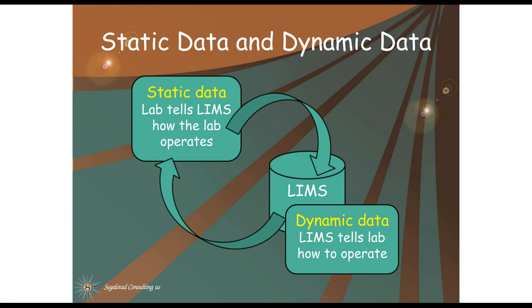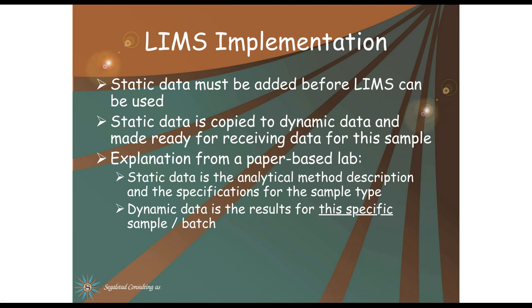We will have to populate the database with our data and our way of working. When we start using the LIMS live, we create dynamic data for this sample, this instrument, these reagents, etc. And LIMS will tell us how and which data we shall collect based on the static data that we've already created.